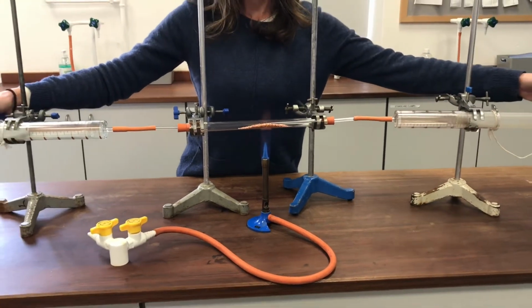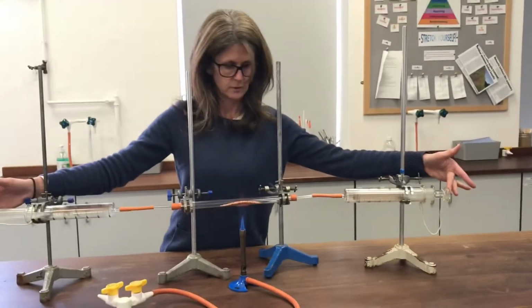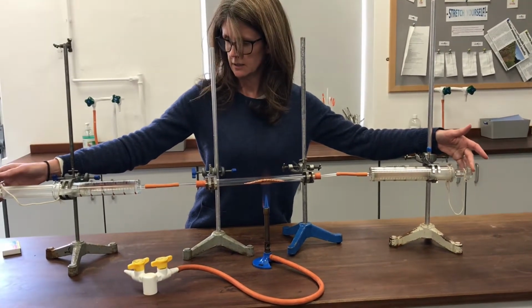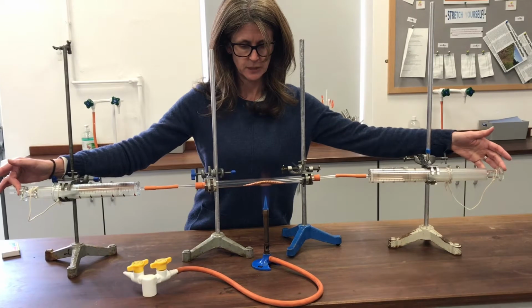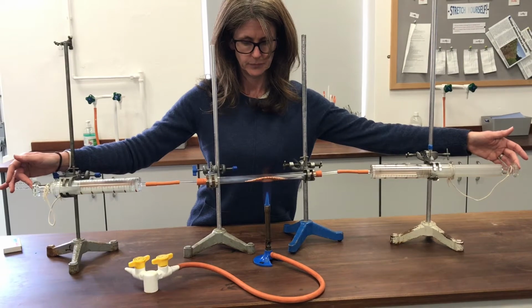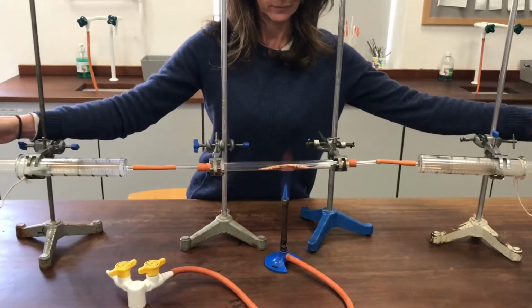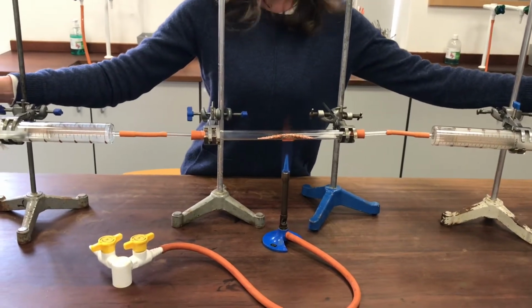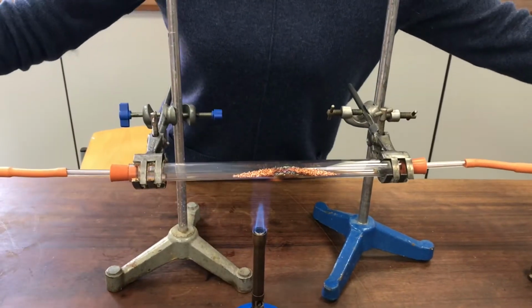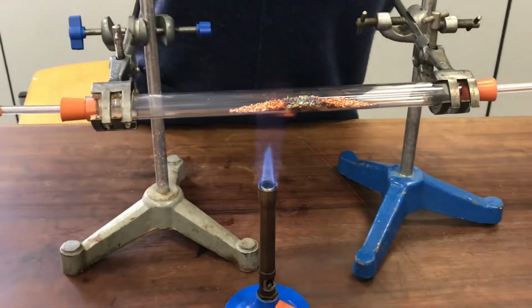It's heating, I hope you can see that I'm using the two gas syringes to shuffle air through that system. So it's pushing from one side and then the other side, letting lots and lots of air travel over that mixture, travel over that hot copper in the middle. You might be able to see if you get close, the copper is changing colour really dramatically as it's reacting with the oxygen in the air that's passing over it.